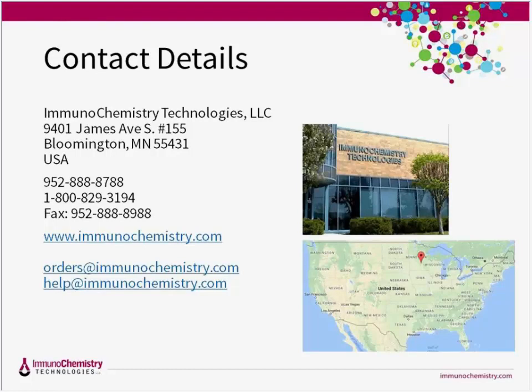Thank you. And our last question today, can FLICA be used in trypsinized cells? Well, trypsinization refers to the process of using trypsin to break down the proteins to dissociate the adherent cells from their culture vessel. FLICA is generally compatible with trypsinization protocols.